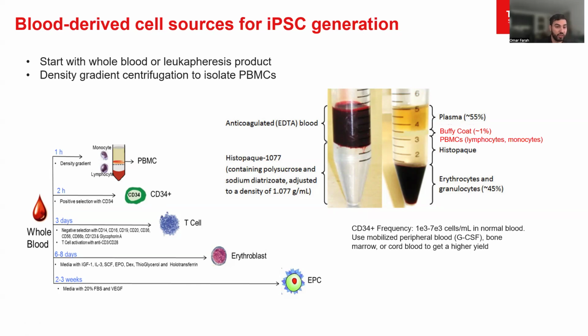You can also do similar things with T cells, where you're going to take your whole blood and select for markers of T cells like CD3, CD4, CD8, or even potentially use negative selection markers, right? Where you're eliminating other cell types by pulling those out as well.